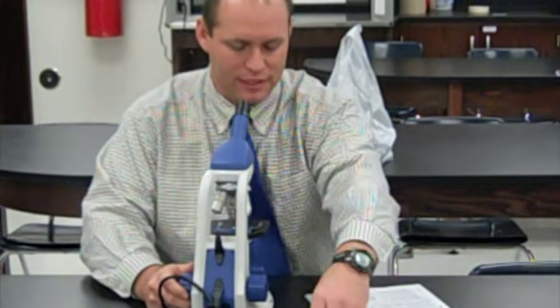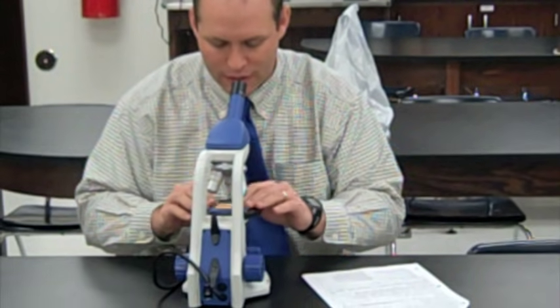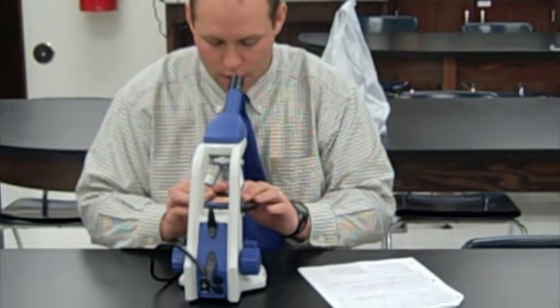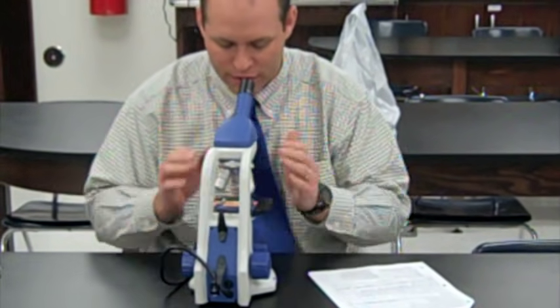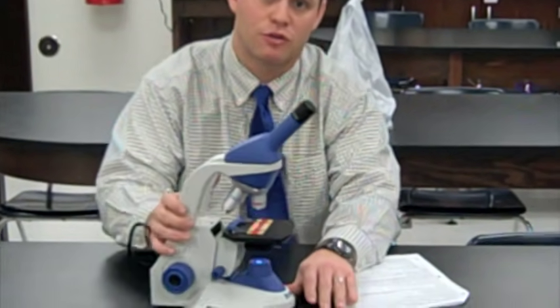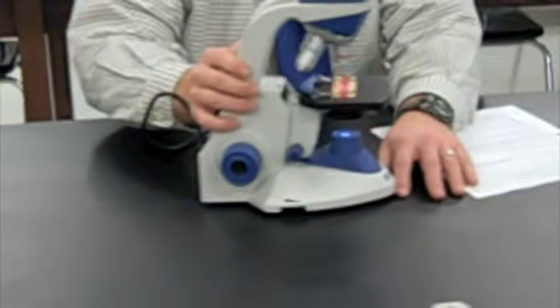Next thing we're going to do is take this slide. We're going to place it onto the stage, and we're going to align it so it is properly underneath the objective lens, and that it is above the light source, so it is sort of centered right there. You could zoom in right there to try to look at that.